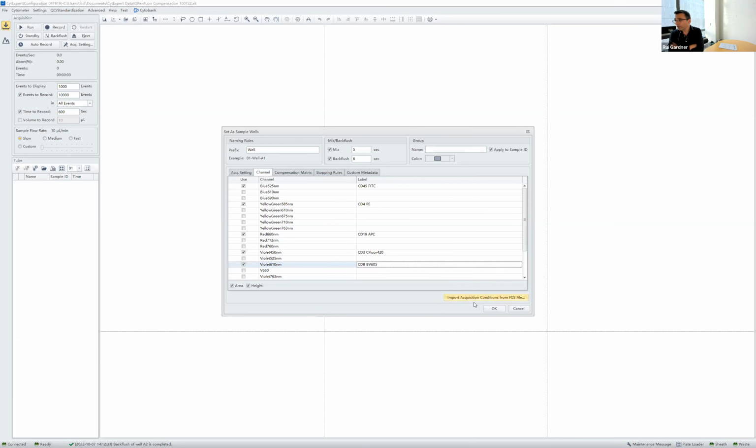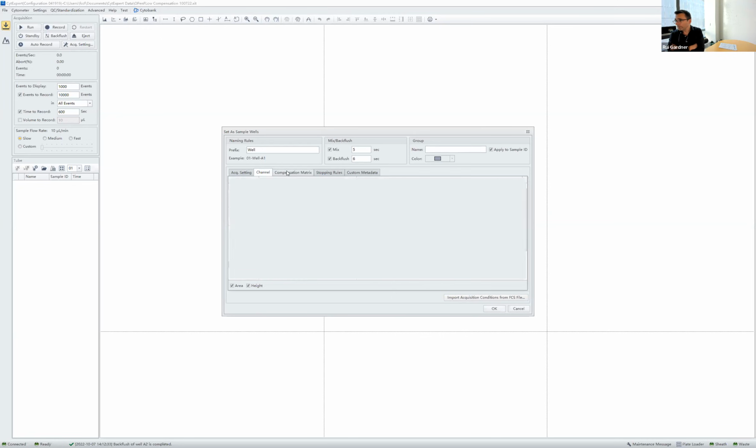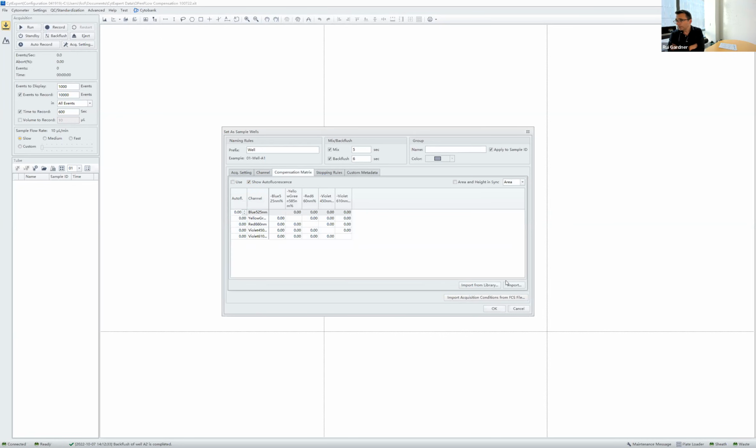So this was done with fresh comp runs on the same day, but still things weren't working well. Many parameters were over or under comped, especially with viability dyes. They use the CytoTrol cells for viability. And then the Beckman-Coulter rep said that CytExpert, the software, tries to comp well, but they feel it fails. So they gave up and started doing it manually, which is obviously not ideal and very subjective.